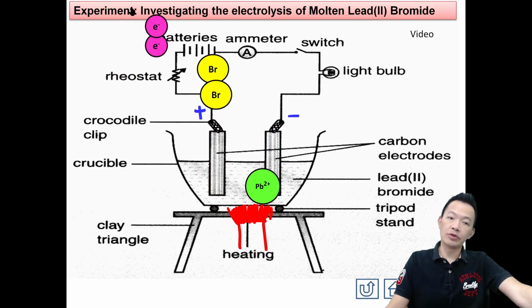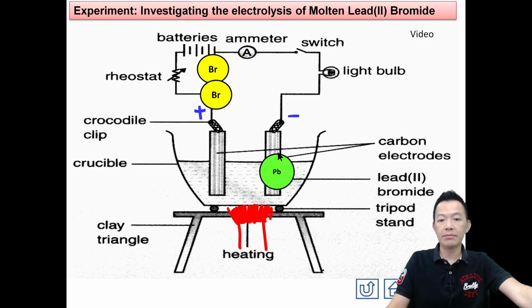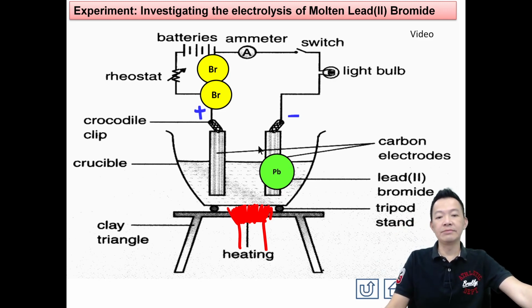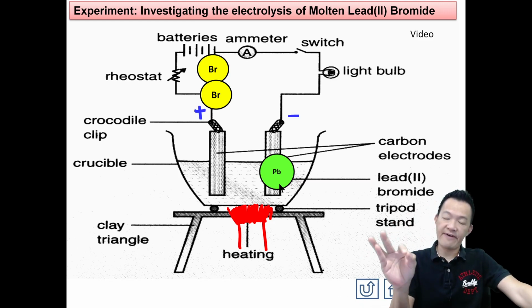Okay? And electrons are going to pass through the circuit. Electron 就会流过我们的电路 and go to the carbon electrode 就会来到这是碳的 electrode. So what is going to happen? 这边什么事情发生 Lead ions are going to gain electrons 就会收到 electrons and finally become lead 啦Lead 的离子在这边就会收到 electron 就会变成了 lead okay? So lead is going to deposit on the carbon surface 它粘在碳的表面上 So you can get the silver gray solid 灰发光的固体了这个就是我们所谓的铅来的 okay?